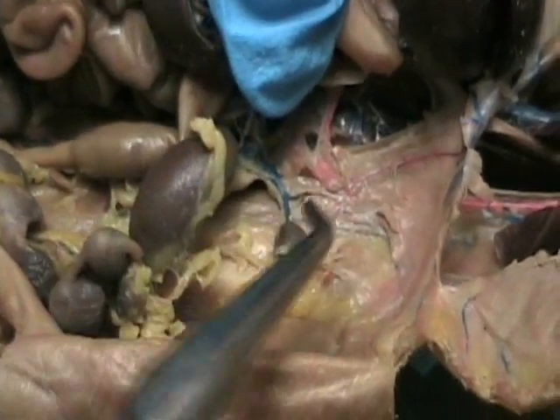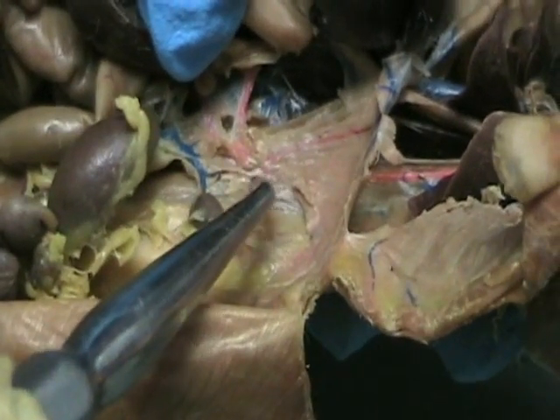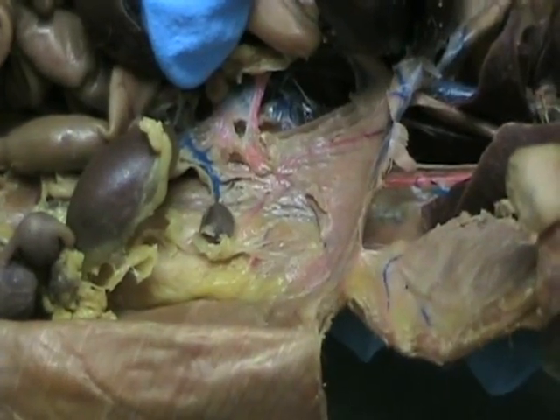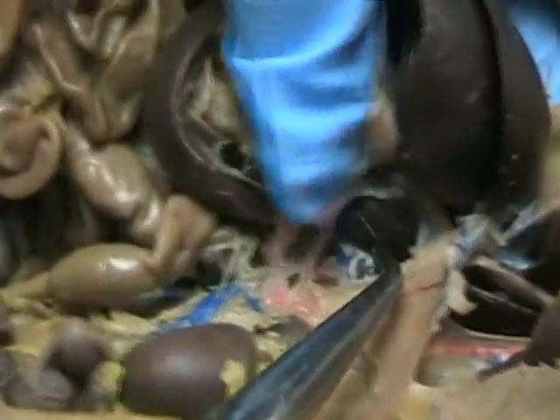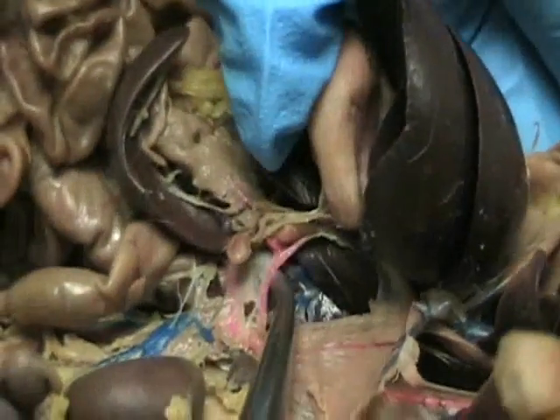And this one isn't a greatest example, but still you can see some pink going to the diaphragm, you can see some pink going to the adrenal gland. So, adrenal artery. Okay? Then you continue on down. Now we can finally see the aorta again. And then the next huge one, this one I'll always find, and you should always find too.